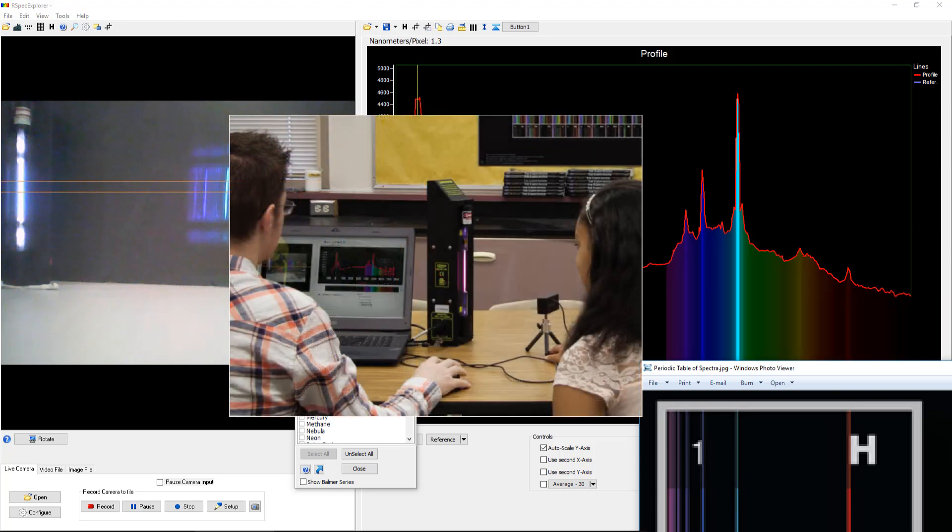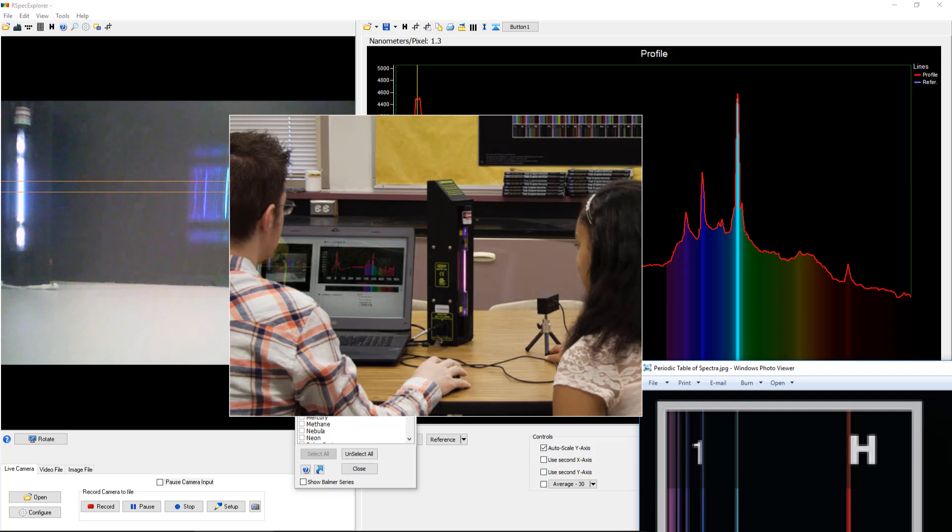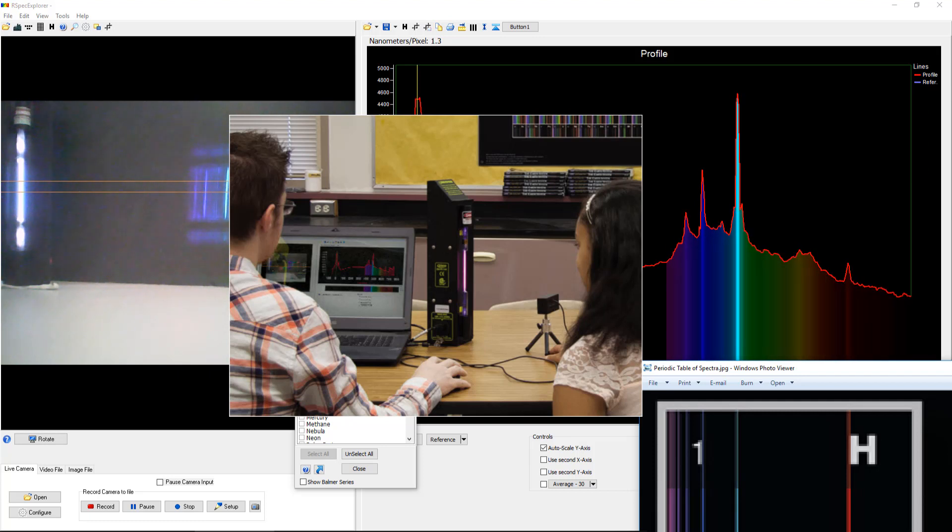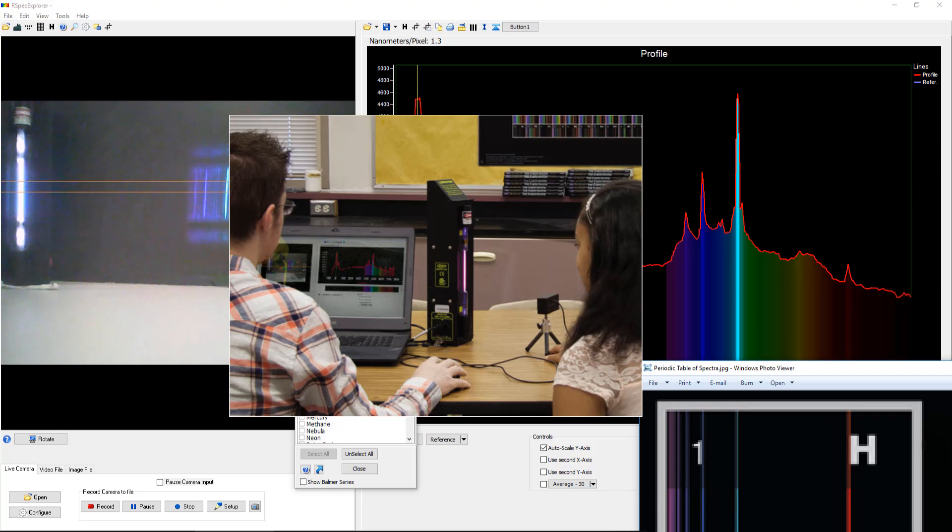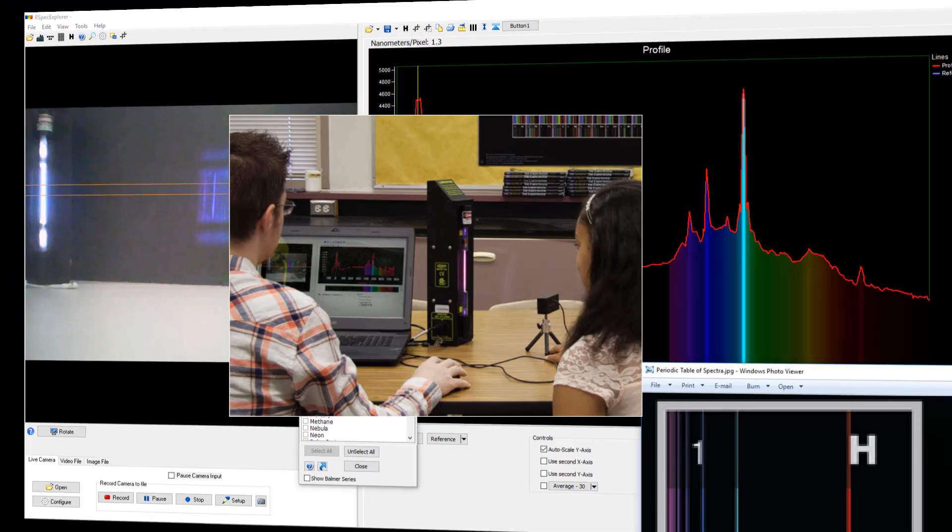RSpec Explorer can also be used in hands-on labs. Student teams like this one might use RSpec Explorer to identify a mystery gas tube like we did earlier. In fact, we're going to finish up this video with two quick examples of labs. One is for flame spectroscopy and the other is for color studies.